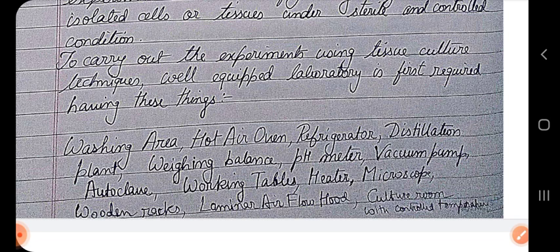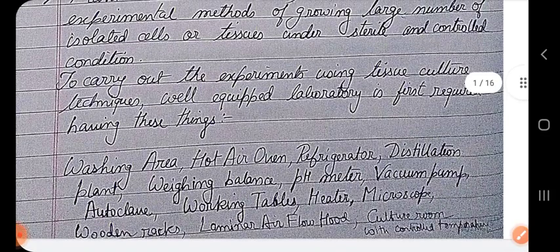Then a pH meter has to be maintained while preparing the media. It has been said that 5.6 to 5.8 is the optimal pH when you are preparing the tissue culture media, the culture media. In that media we will grow the plant tissues, right?